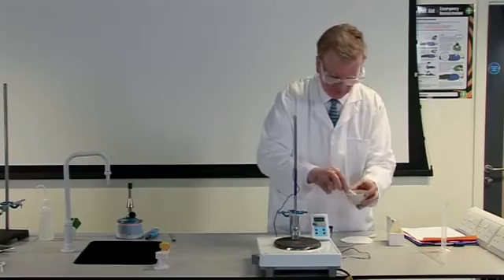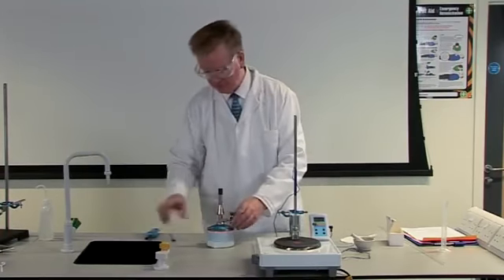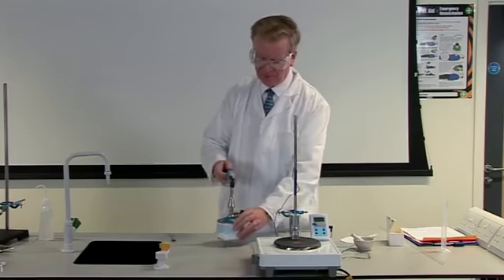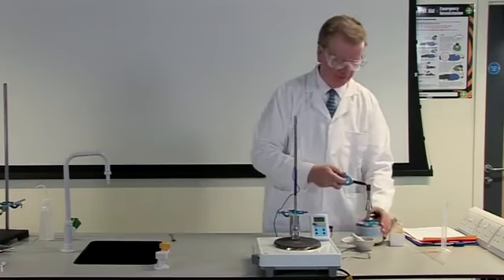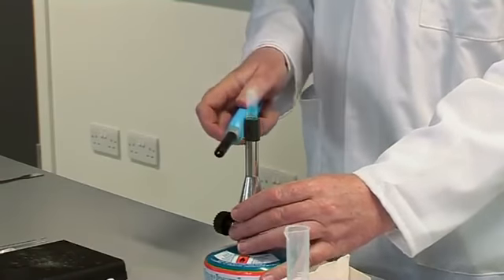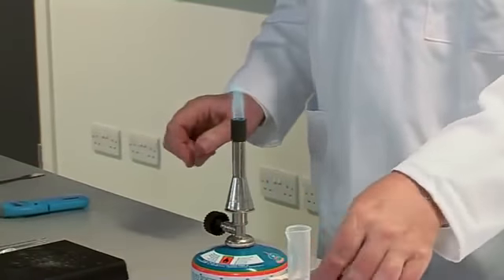Seal the end of a capillary tube by rotating it for a few seconds in the blue flame of a Bunsen burner. Rotate the end of the capillary tube into the sample of benzoic acid crystals.